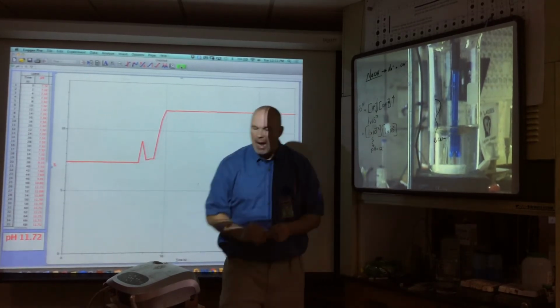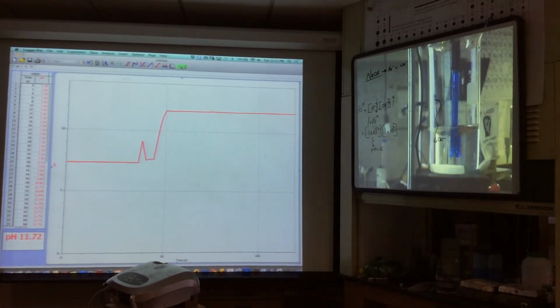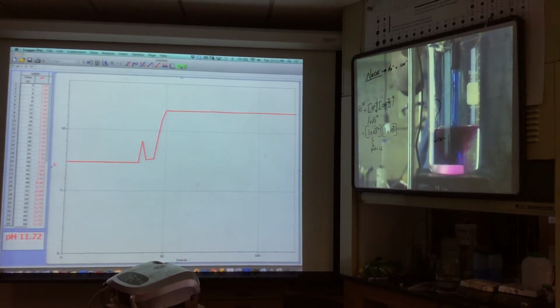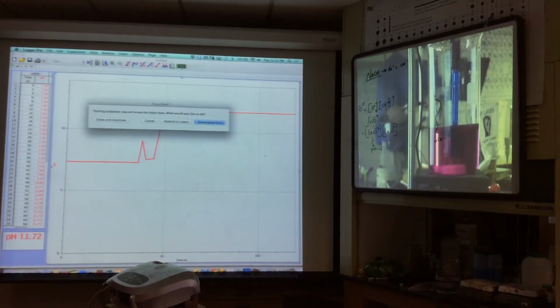Now, I'm going to add a chemical to watch this happen. I'm going to add something called a chemical indicator. I'm going to use something called phenolphthalein. Phenolphthalein turns color in the presence of acids and bases. So I'm going to add phenolphthalein. Okay, so it makes it a nice, pretty compound. All right, now, pretty, I guess fuchsia, pink, I don't know. Now, I'm going to add some acid to this.